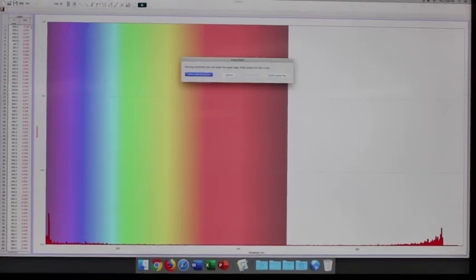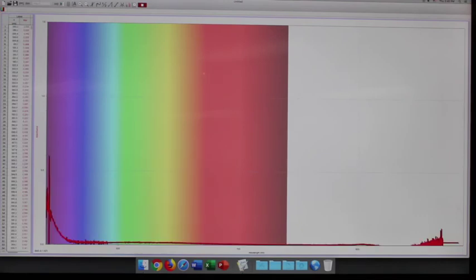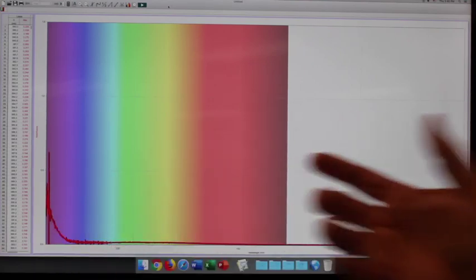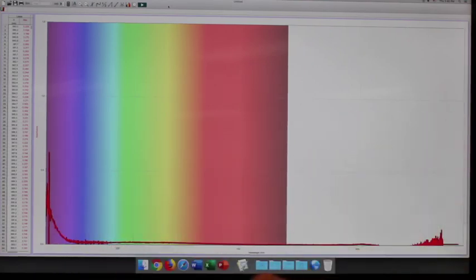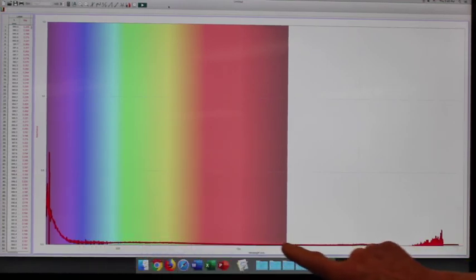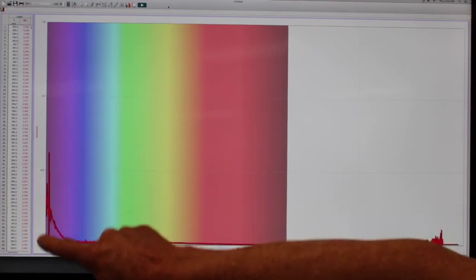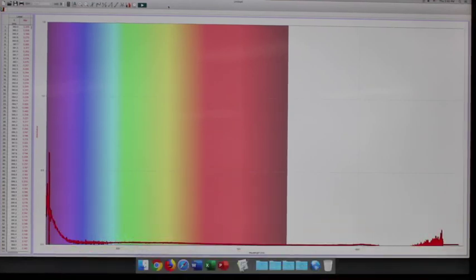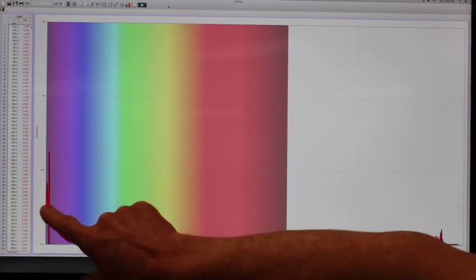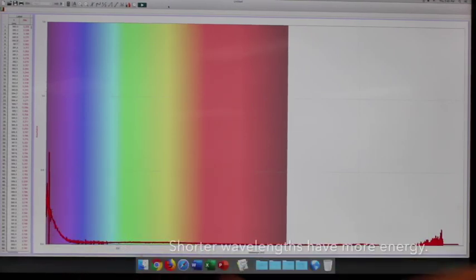I'm going to erase and continue, get rid of that red line, and then I'm going to press stop. And this is where we're absorbing. So onions are purple, which is interesting because here we're actually reflecting all of this blue light clear up through the red. We're actually absorbing purple. So the fact that our onions are purple means that we're reflecting off this purple while we're absorbing this purple, and that changes the color of purple that we actually see reflecting off from those onions.